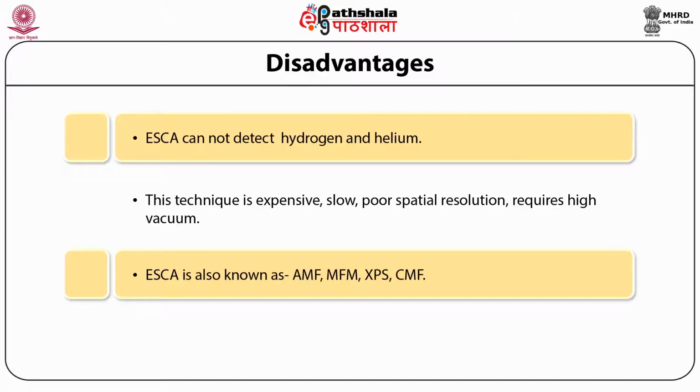We'll find out what elements are there at the surface. If the percentage remains the same, that means the layer had a very uniform concentration of various metals or elements on the surface.